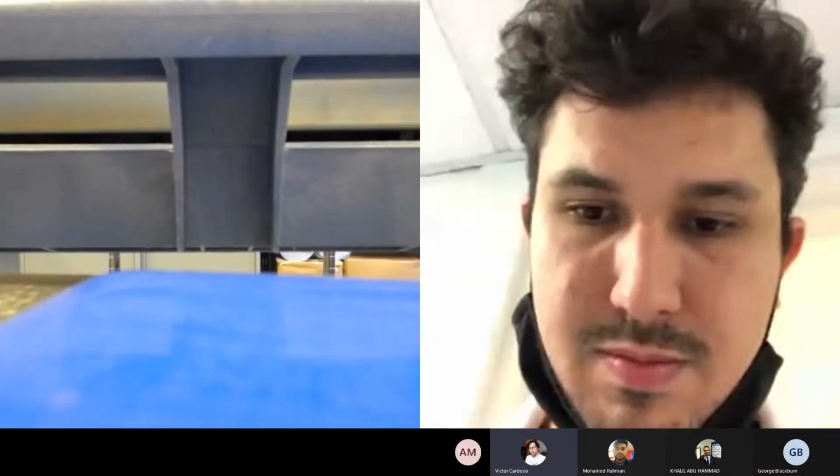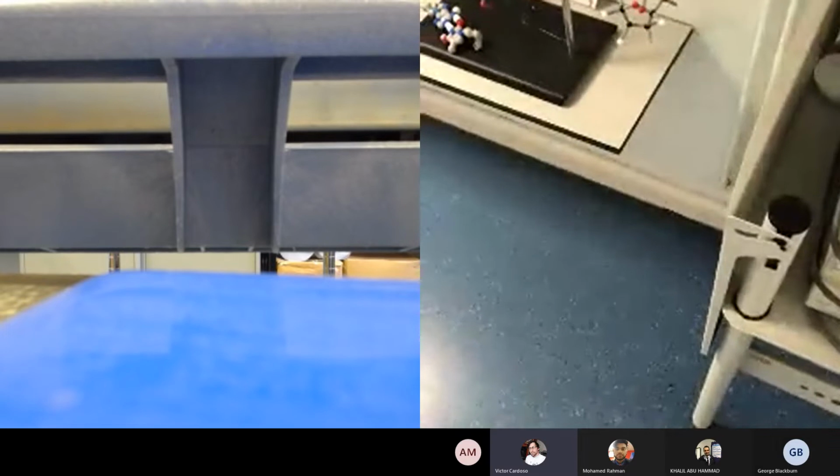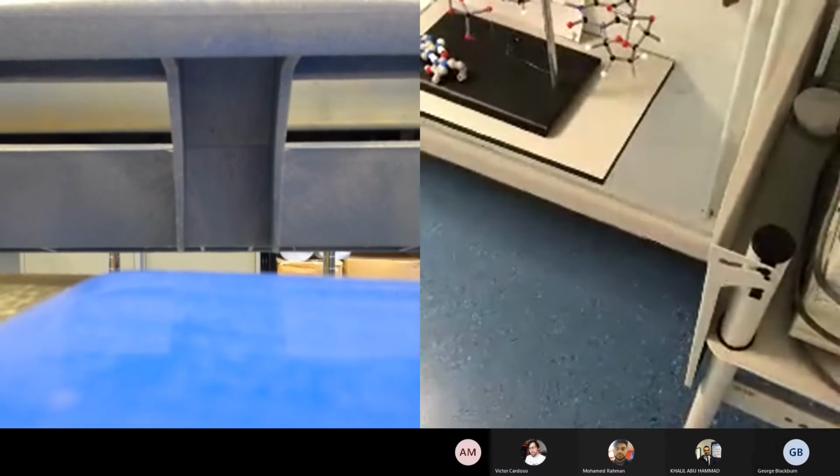Isn't it based on the absorbance of light the cells that we're checking can absorb? Yes, that's right. And what's the wavelength that most proteins absorb at? Why do we set, when we're making measurements on proteins, why do we normally set the wavelength to 280 nanometers?